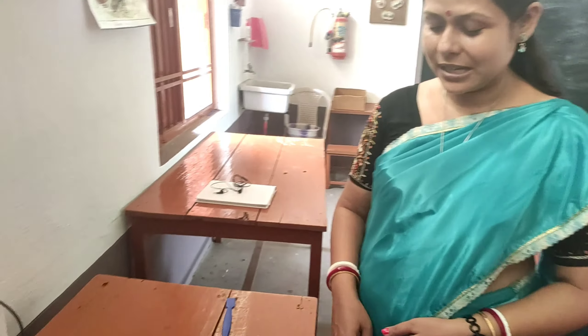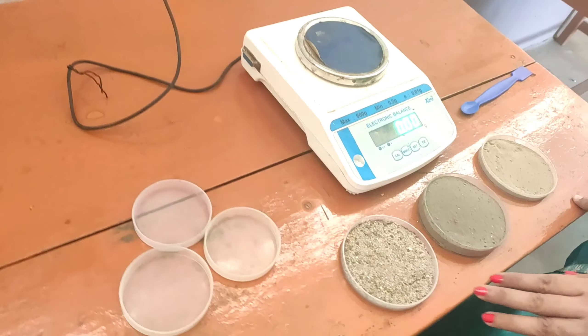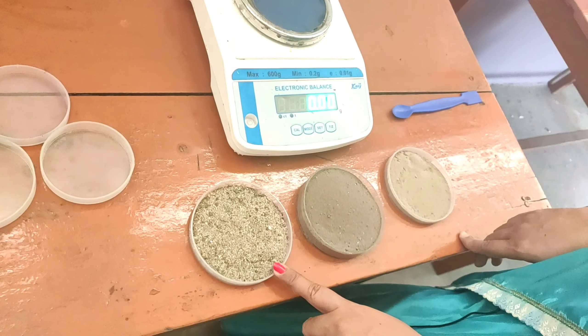Hello students, today we are going to do a practical related to the study of water holding capacity of soil. For this we have collected three different soil samples — sample A, sample B, and sample C.